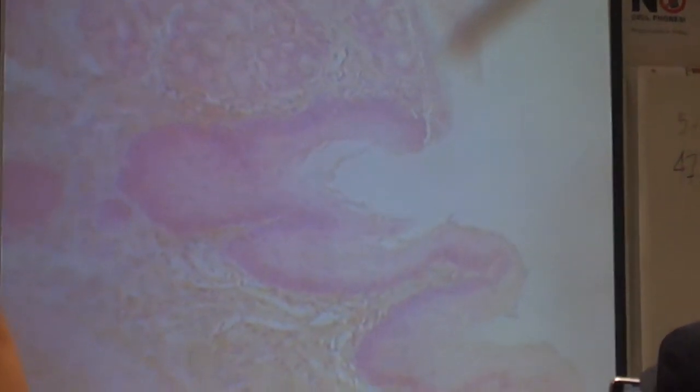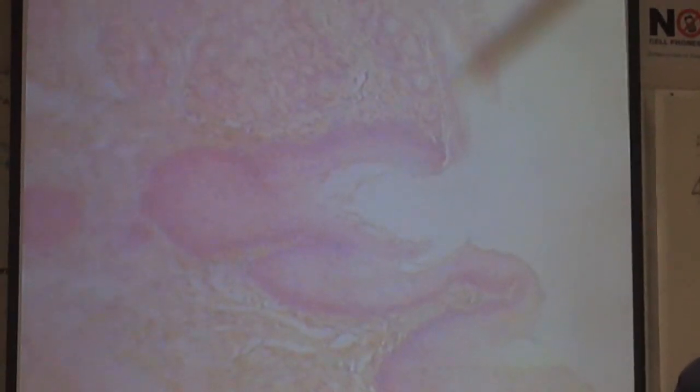Now the epithelial lining of the stomach is simple columnar. And let's see if we can actually see that or not. Sometimes these slides are variable in how good they are, but we'll see. You probably can't. Need a little more magnification for it, but you can definitely see it's different. We'll go to higher magnification for this one. Well, probably getting decent contrast on this, but it's definitely simple columnar.